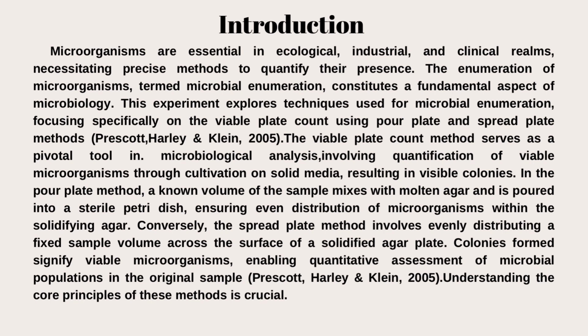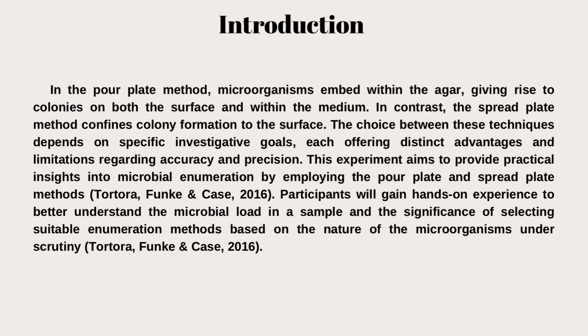Understanding the core principles of this method is crucial. In the pour plate method, microorganisms are embedded within the agar, giving rise to colonies on both the surface and within the medium. In contrast, the spread plate method confines colony formation to the surface. The choice between these techniques depends on specific investigative goals, each offering distinct advantages and limitations regarding accuracy and precision.